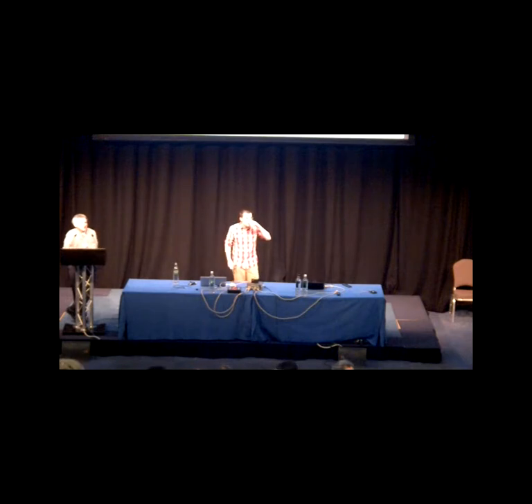Frank, the multi-template stuff that you're talking about. Could you use that alternatively for a single template but multiple alternative sequence alignments? If you had suboptimal sequence alignments, because Rosetta gets stuck quite often when the sequence alignment is wrong. Yeah, you could, and Yifan has looked at that a little bit. One of the problems is that when the sequence alignment is wrong, if you generate alternate sequence alignments, the second one is also often wrong. But Yifan has looked at that, and that definitely works.